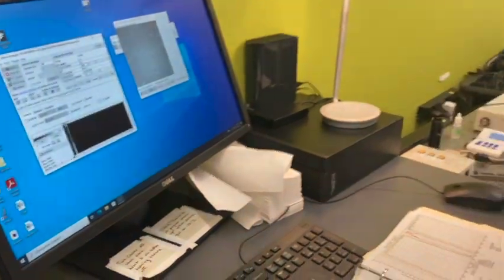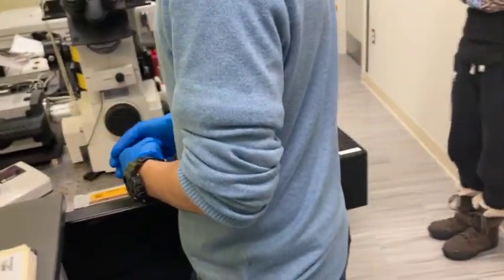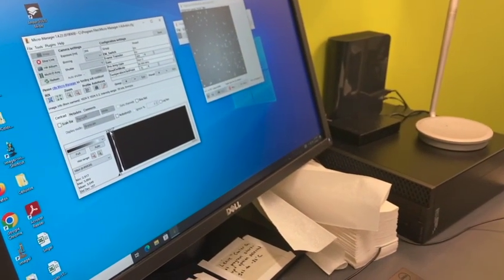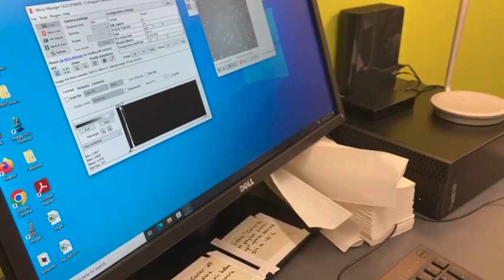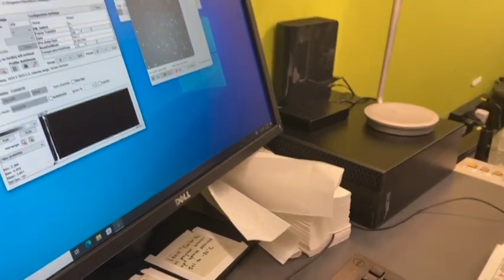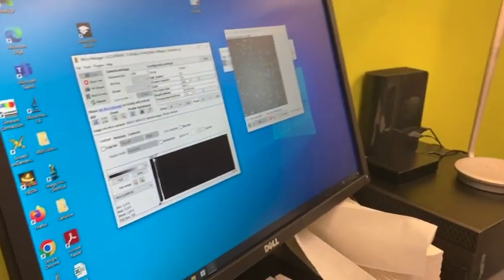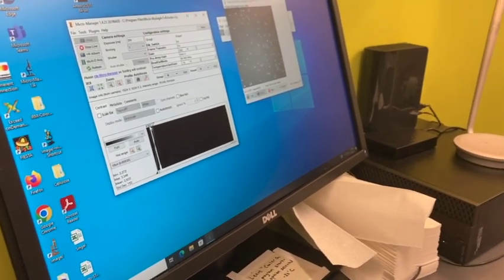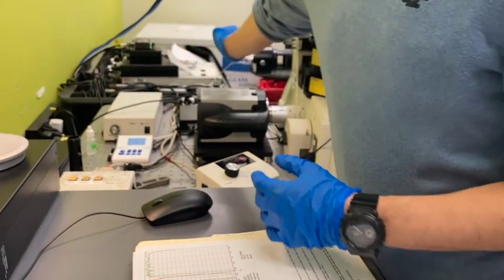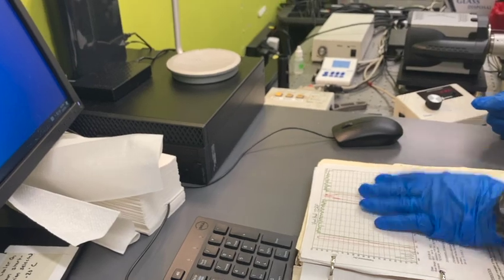We don't want this. What? We don't want this thing. Yeah. Sometimes people want it, sometimes you want to go in depth into a cell, if you want to look at cell structure or something like that. Because for normal TIRF, we only have 200 or 300 nanometers. And that's the one I hope no one is going to change, or at least let me know if you want to change it.